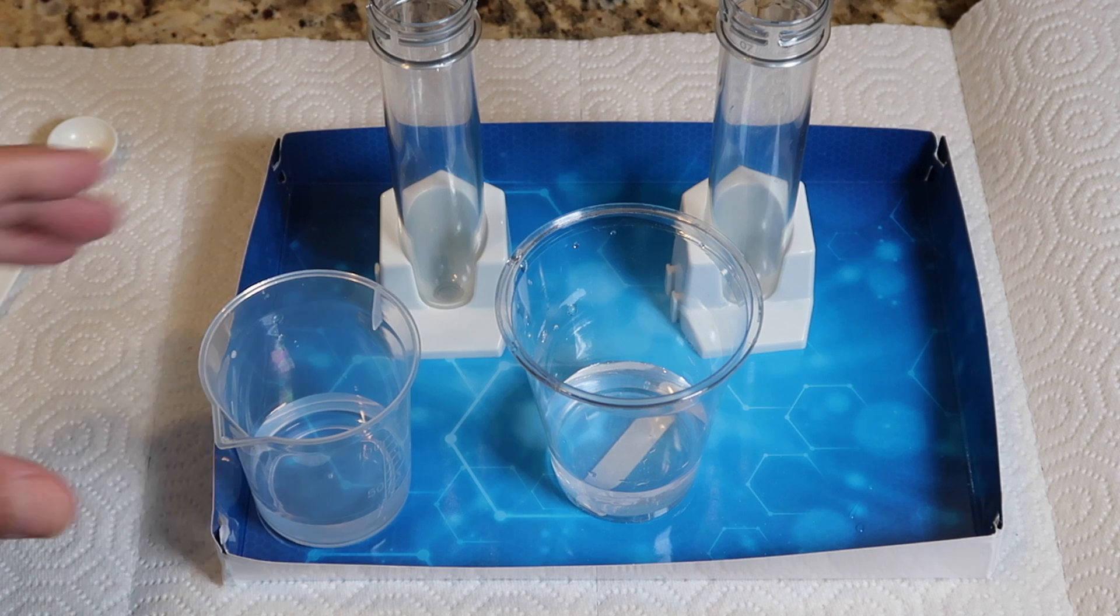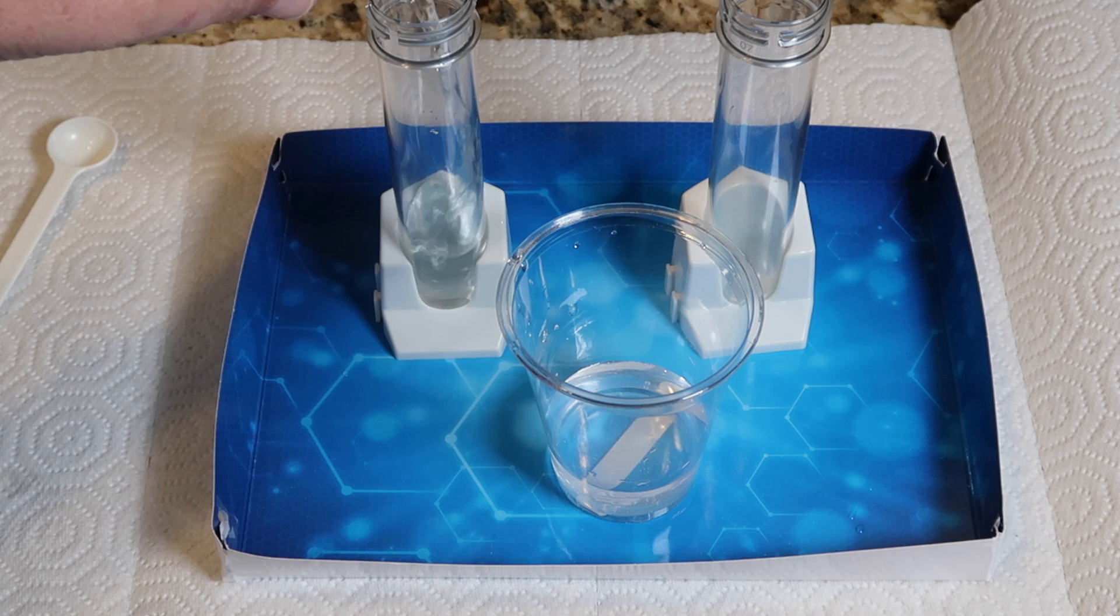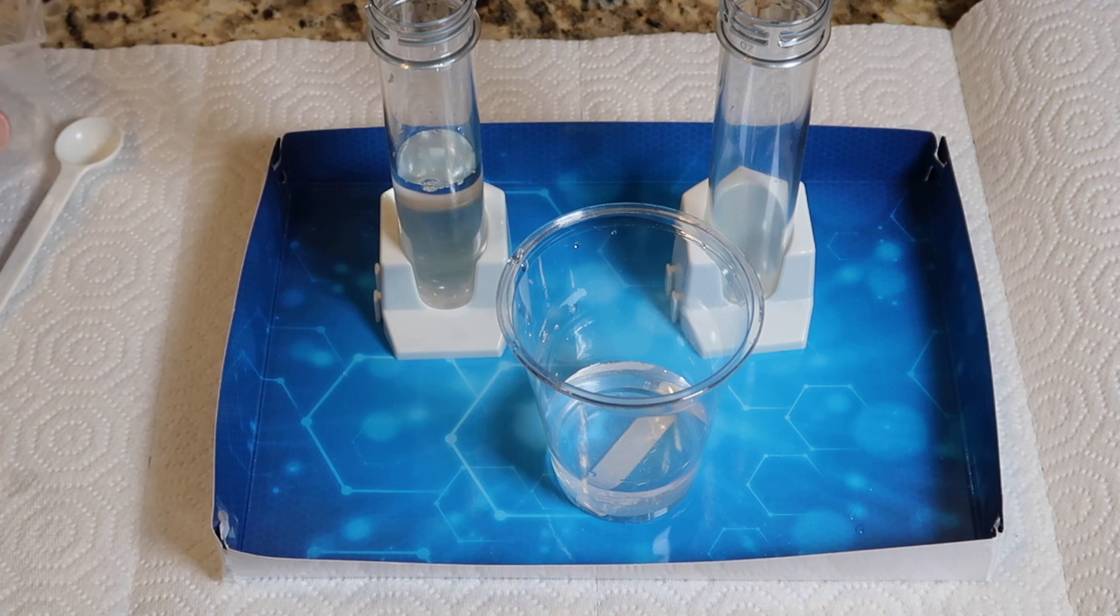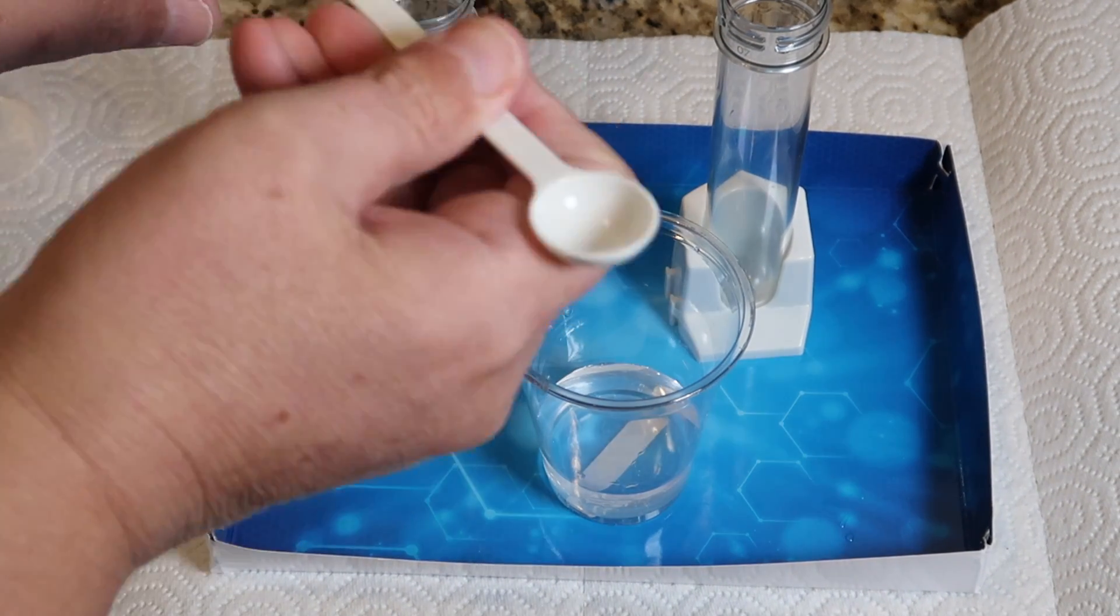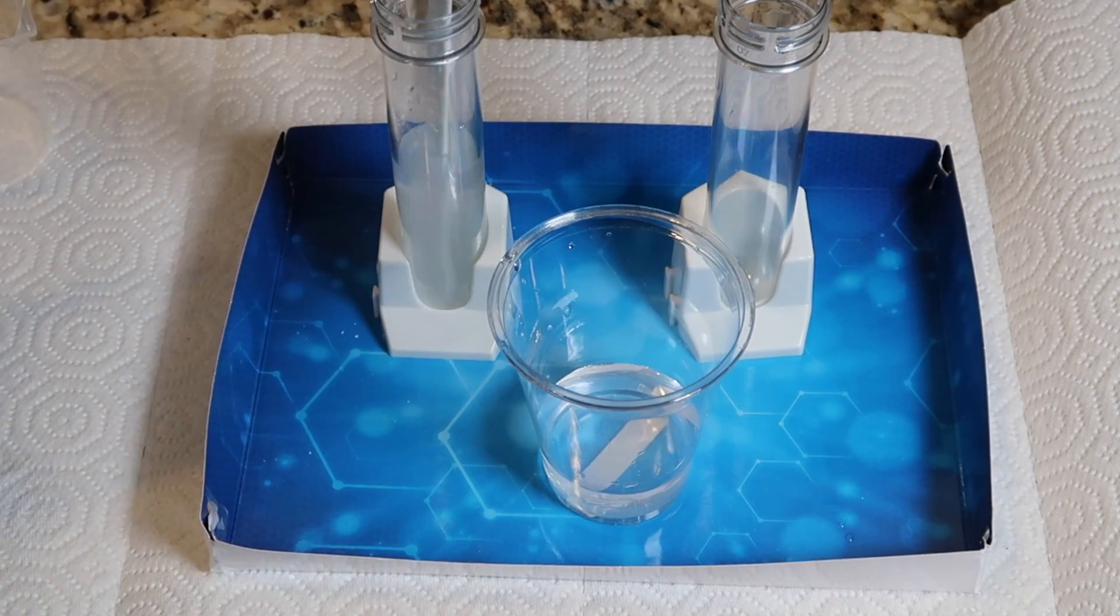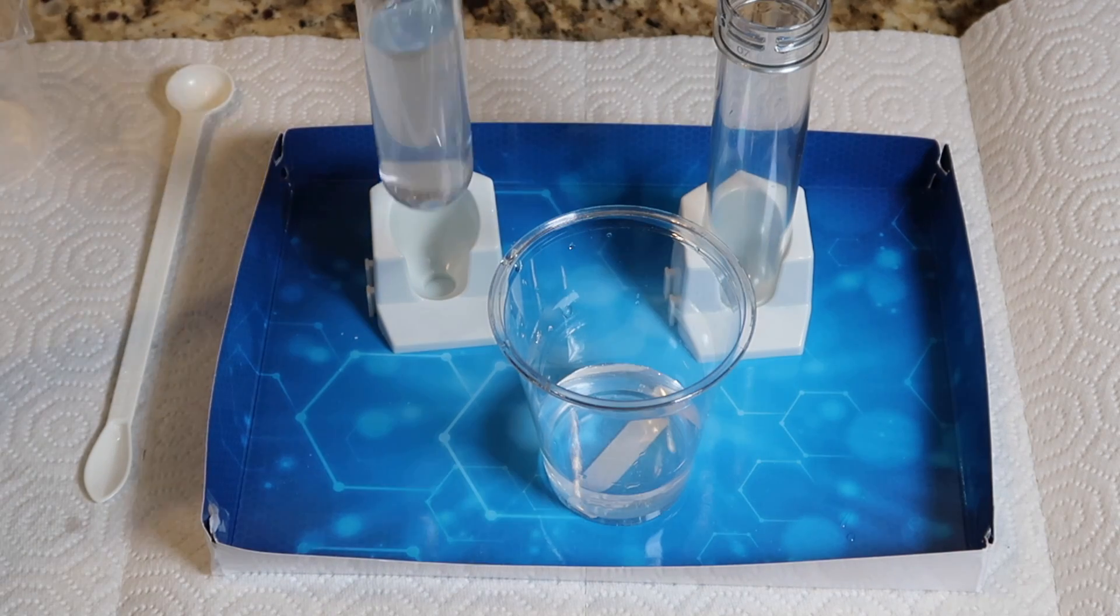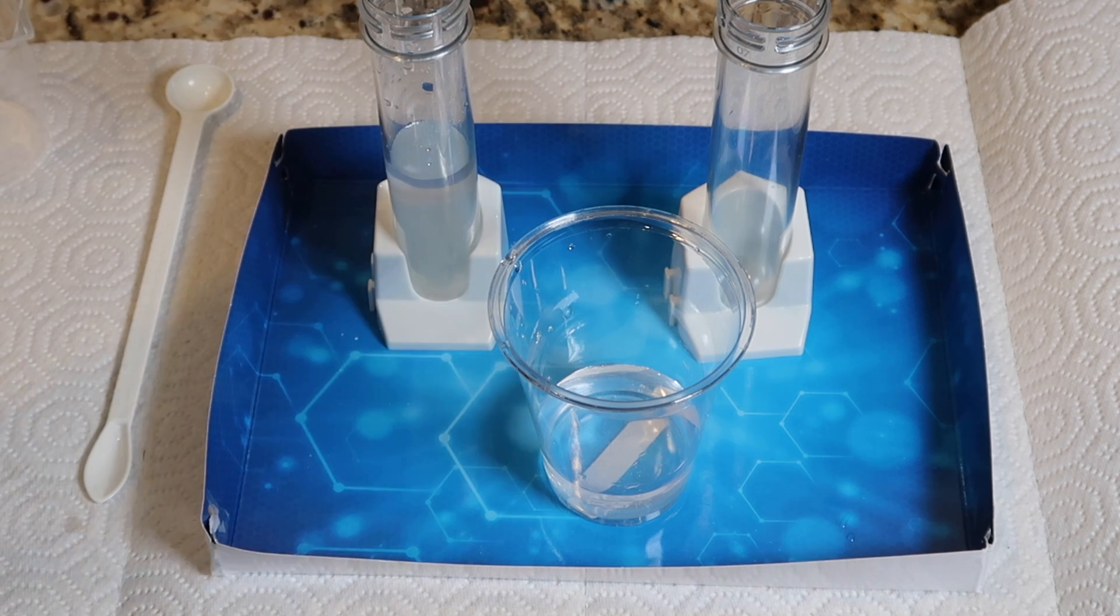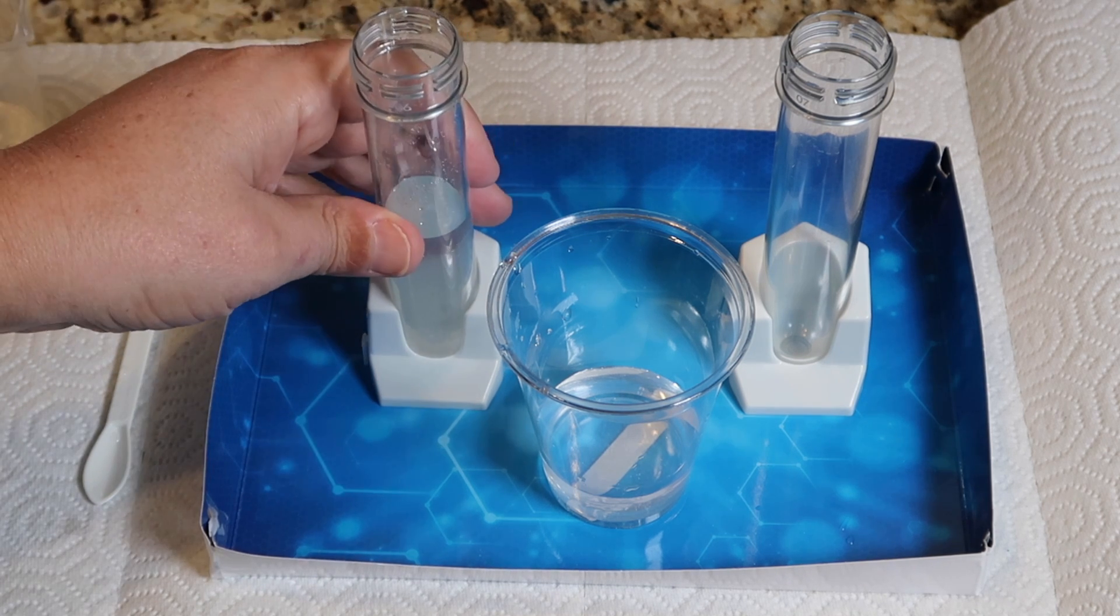Now we're going to take another 30 milliliters of water and put it into the first test tube, into which we're going to dissolve two medium scoops of calcium chloride. I think that's a good solution. Now when we mix these two solutions together, we should get a milky white solution, which is basically turbid. In other words, the particles are suspended in the solution rather than dissolved.